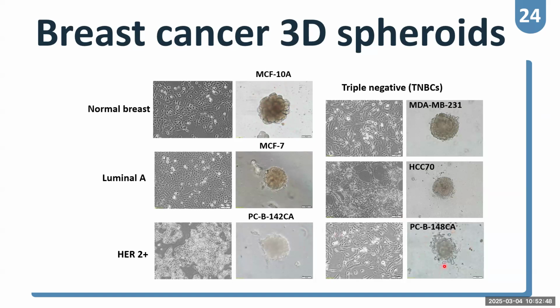Anyhow, when you see this, for example, this is my established cell line, the 148 breast cell line. You see, they're not round shape, but they have something like pseudopodia. They have legs. It means this type of cancer patient has a highly invasive behavior. Okay, and when we look at the genetic and gene expression, we have seen a lot of high expression of genes involved in cell migration and cell proliferation.